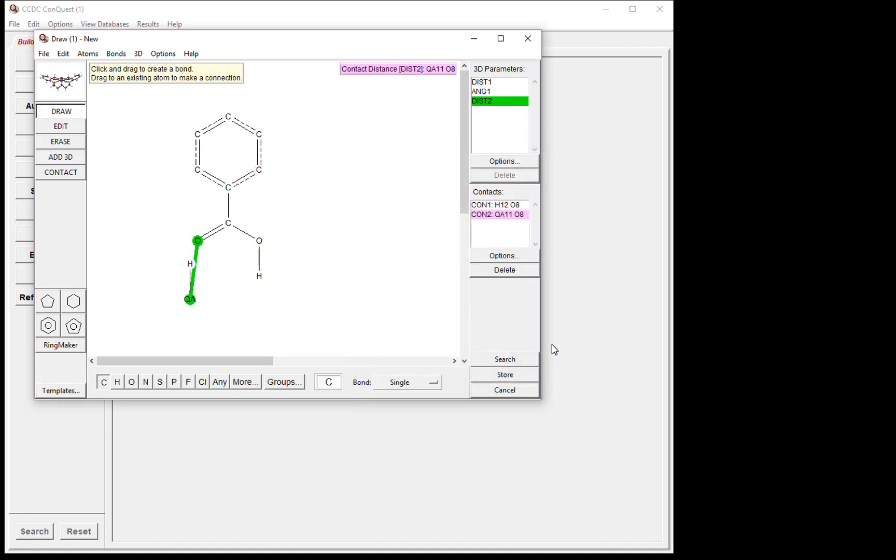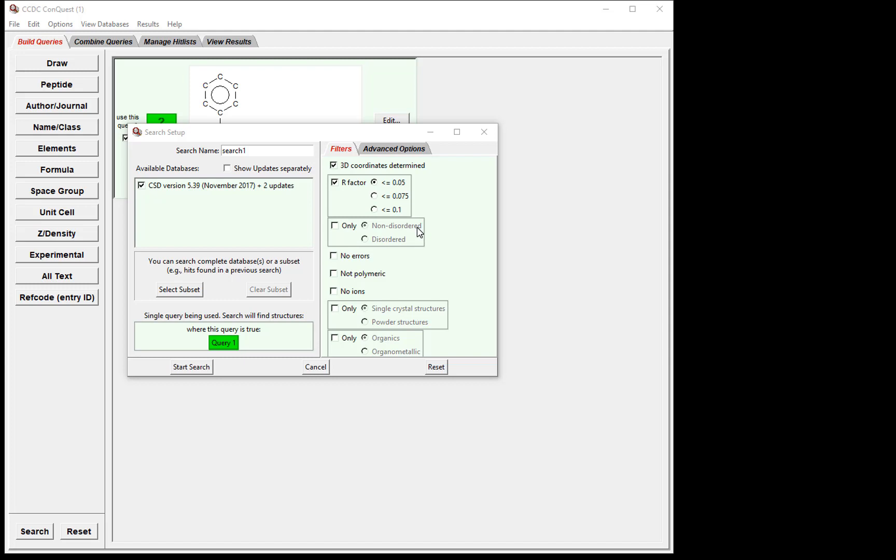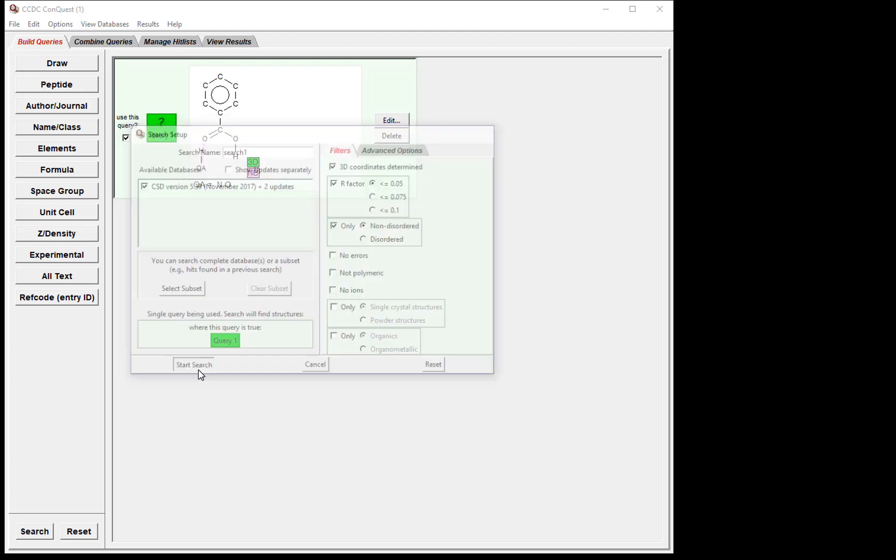Now we are ready to start the search. Click the Search button to bring up the Search Setup window. Here we can apply filters to make sure that we have the highest quality data. First, we tick the box for 3D coordinates determined. We want to tick the box next to R factor, and the radio button next to less than or equal to 5%. Finally, we want to make sure that we are only dealing with non-disordered structures, so tick the box next to only non-disordered. Now we can start the search by clicking Start Search.